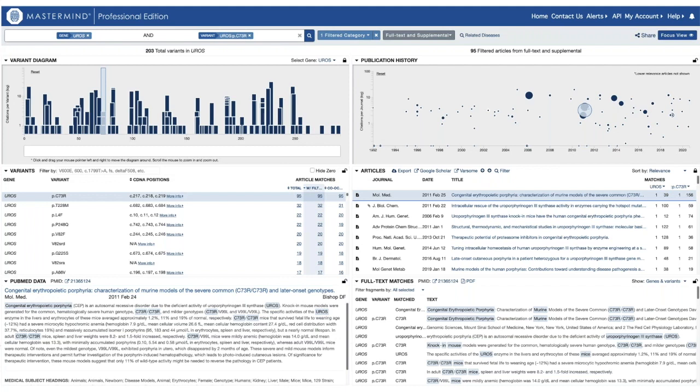So right now, by default, it's genes and variants. But if a user enhances the specificity of their search by adding phenotypes or drugs or diseases, you're able to toggle that sentence display to see those sentence fragments in context of the cited search term as well. So a very powerful shortcut to get at whether the content that you see displayed from the reference citations is relevant to your search.